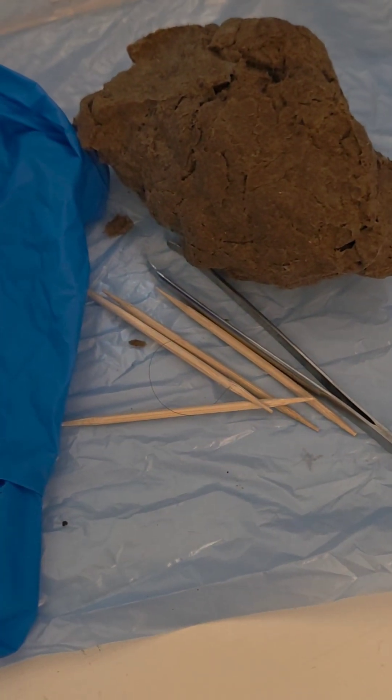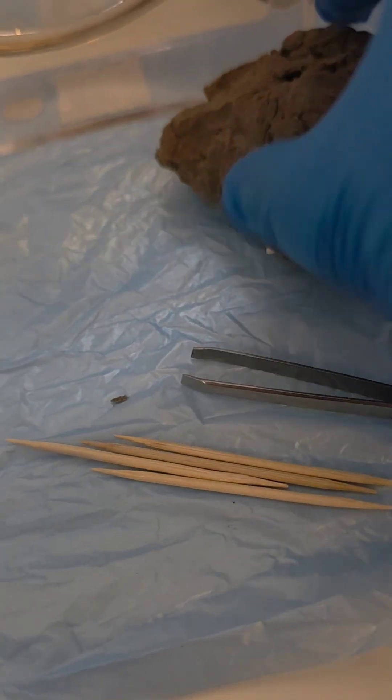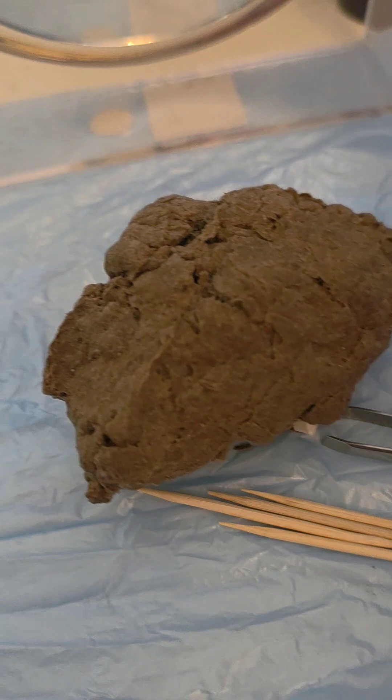Get ready to dissect. Collect your gloves, a toothpick, some tweezers, and a magnifying glass. Be careful when you dissect.